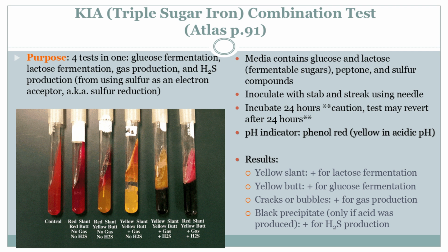Is it really dark black? It can be, depending on how much hydrogen sulfide it makes. It can be a really deep black color. So we're really looking for anything unusual in this tube. You have all these indicators in the agar itself that are going to tell you what the bacteria are doing. So it's like they're sending us signals through the color. Oh, that's so cool.